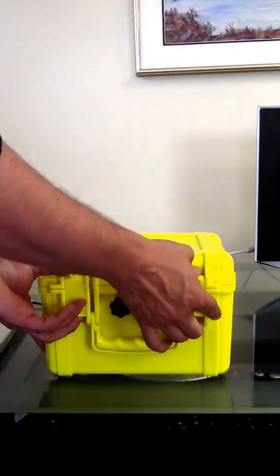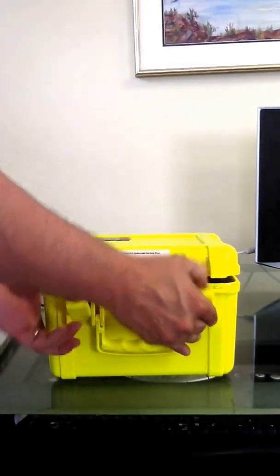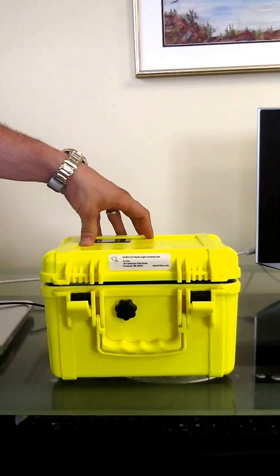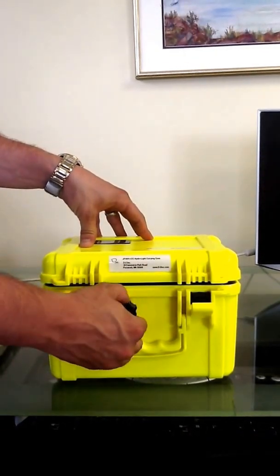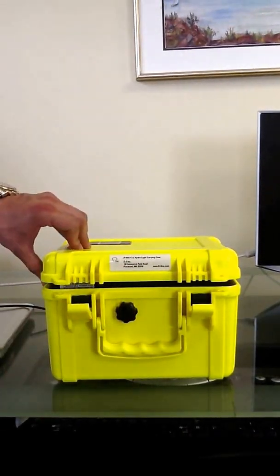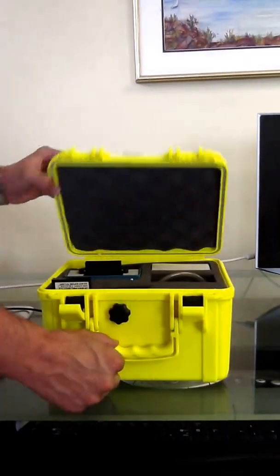I'm going to open it up. You can see that this case is very robust. It's fully waterproof when closed, and it has an air pressure relief valve here. So if you put it on a plane and then land, you can actually open the case again.